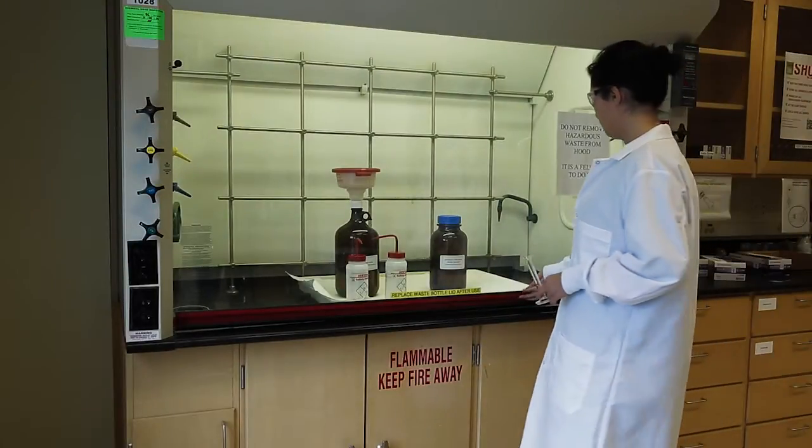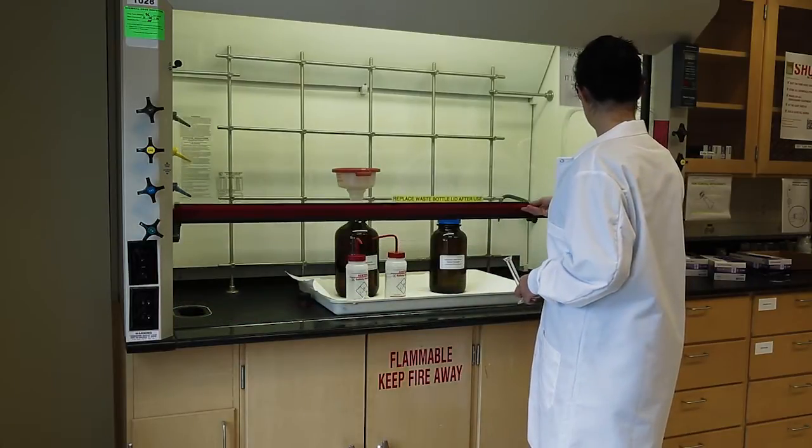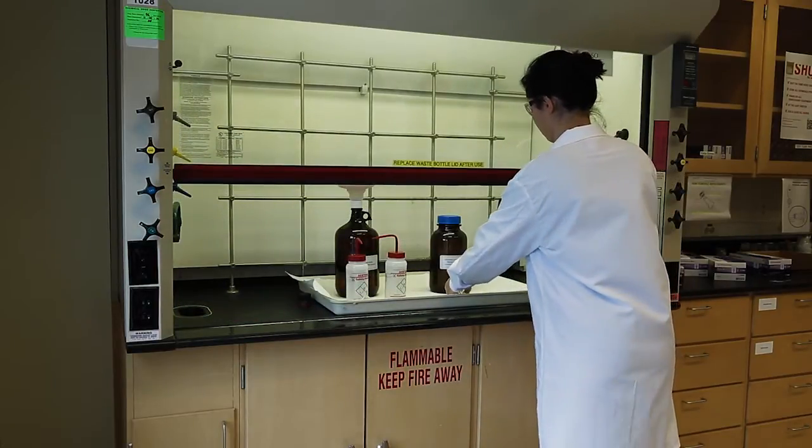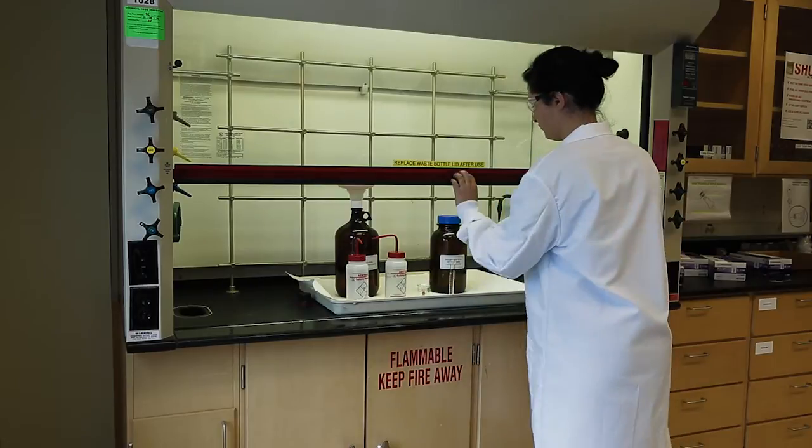Just as it's important to use caution handling the chemicals during the experiment, we must properly dispose of chemicals after finishing the experiment.